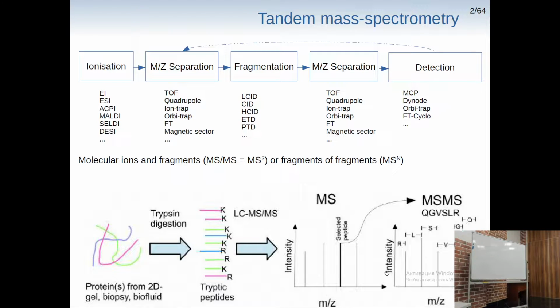So how is it done actually? Mostly in the so-called Orbitrap, it can be programmed to scan all the peaks here and then select those peaks and do the fragmentation for them. Nowadays there is another technology, the so-called quadrupole time-of-flight mass spectrometry, which has some additional benefits. It's not mainstream yet, but probably it will be, and it's easier to understand how it's done.